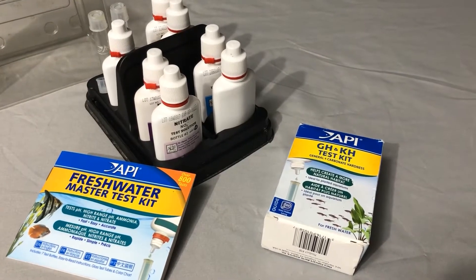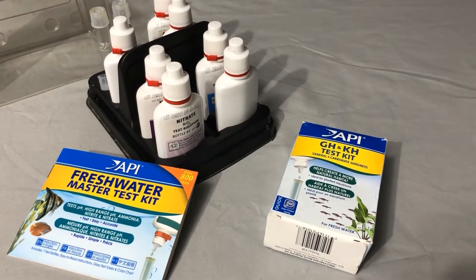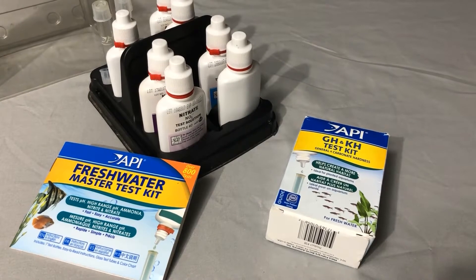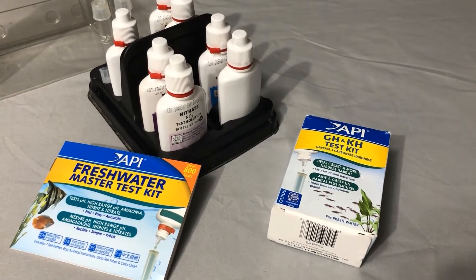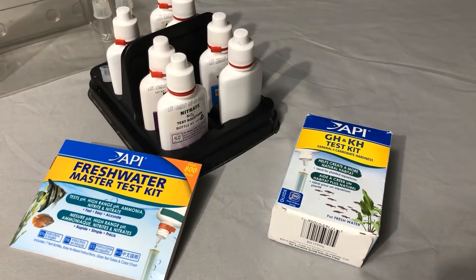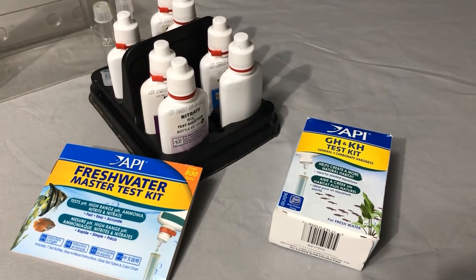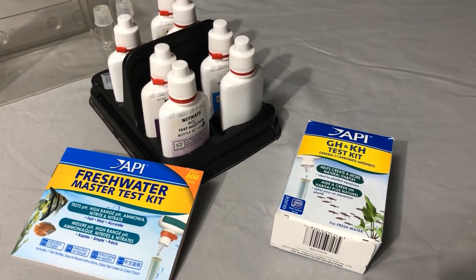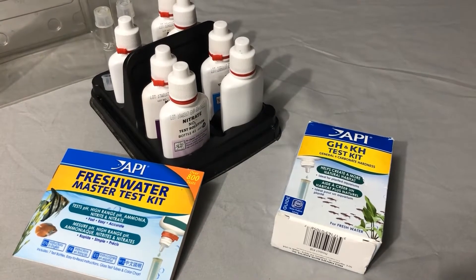To test the water, since it's a brand new tank setup, we need to use our fresh water test kit and an additional GH and KH test kit, which measures hardness and alkalinity. We're going to take some tank water, fill our little vials, and follow the directions for each of these tests.